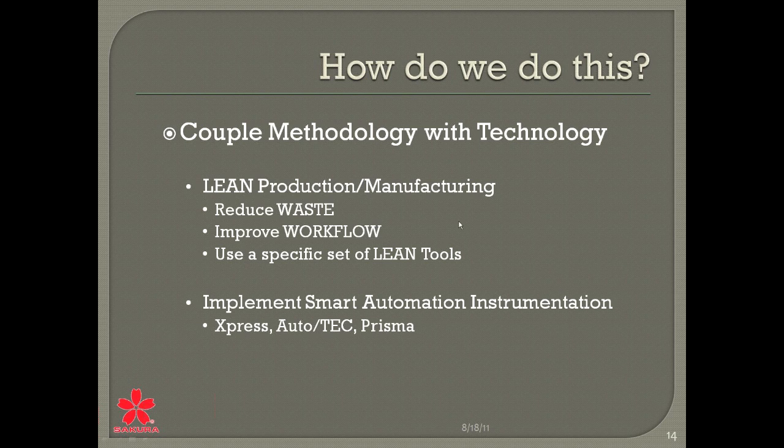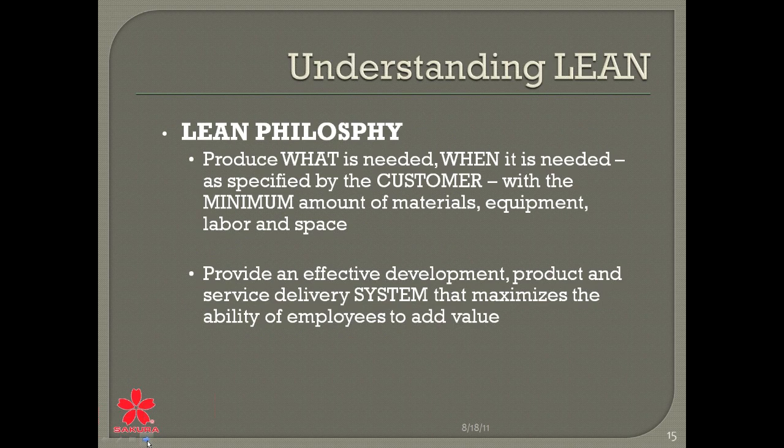So we try to work with that, and what we really loved was the implemented smart automation instruments, and especially the Express and AutoTEC, which took over the embedding, the AutoTEC, and the Express will give you the processing time, but I will come to that as well.